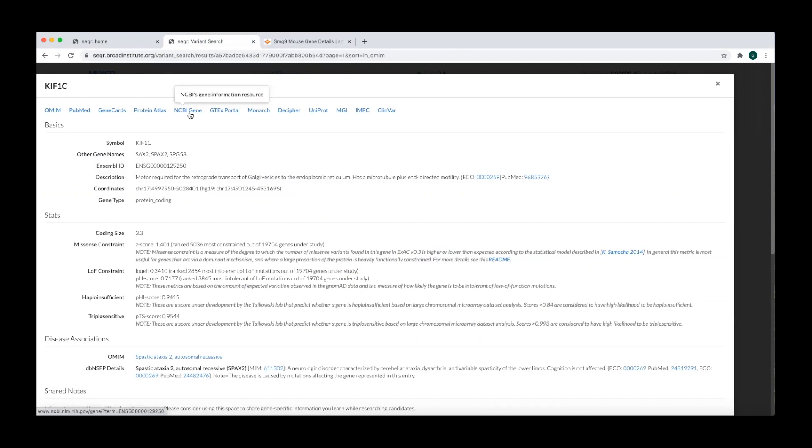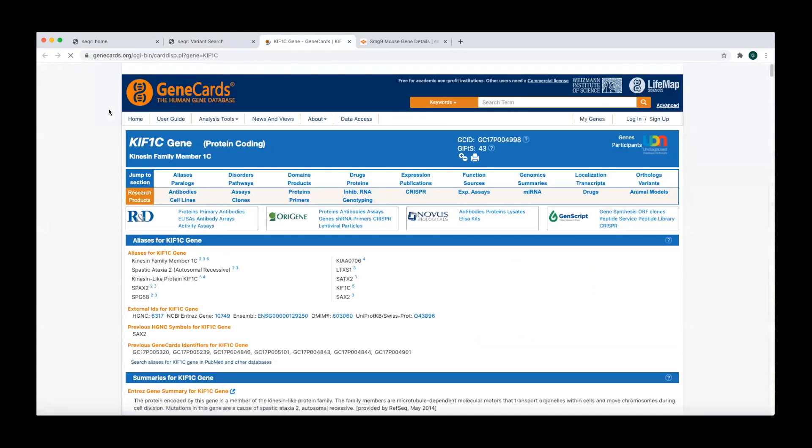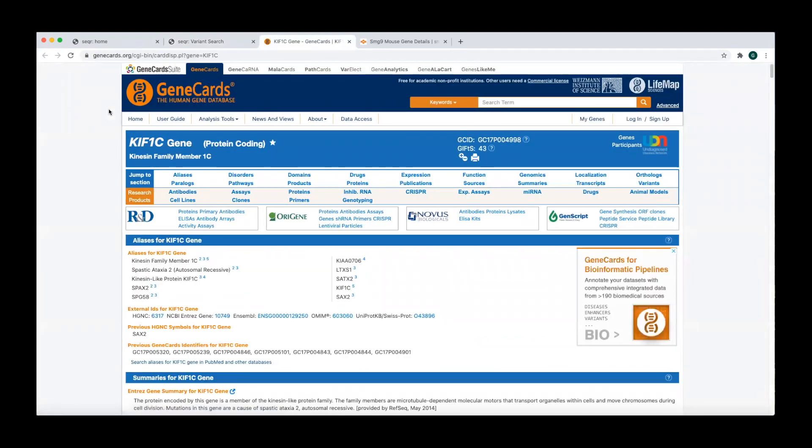The NCBI gene and gene cards links bring you to the gene entries where you can find details about gene structure and function.